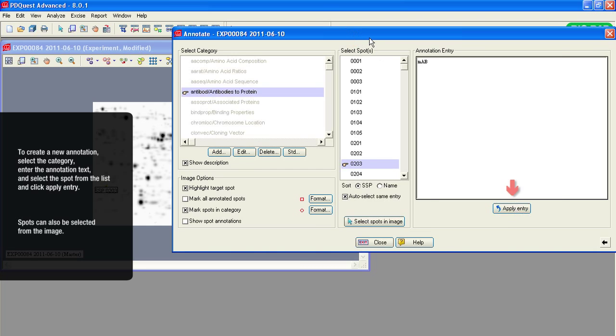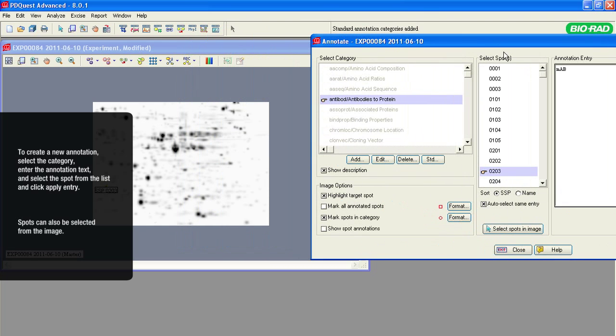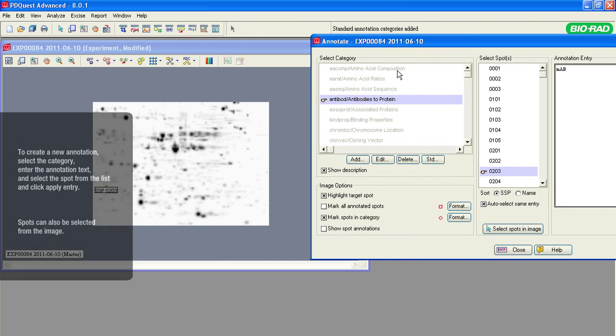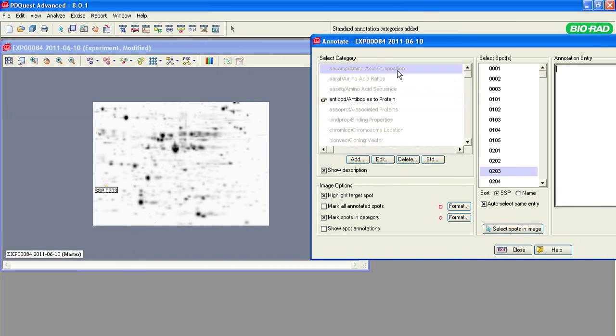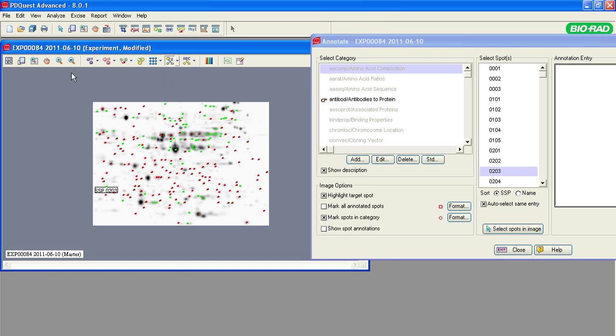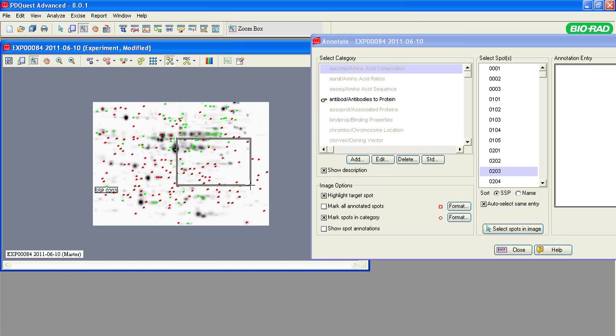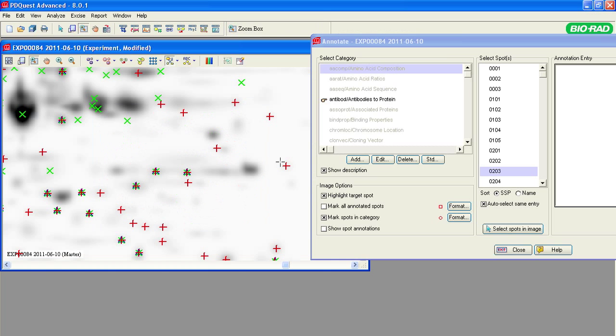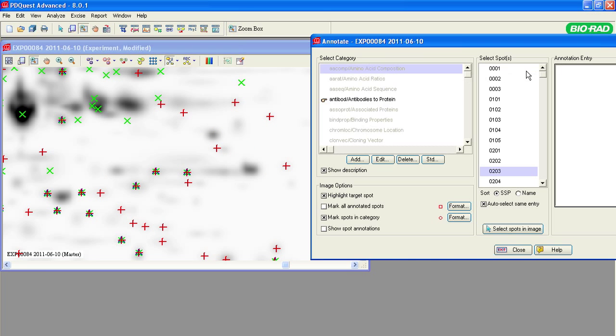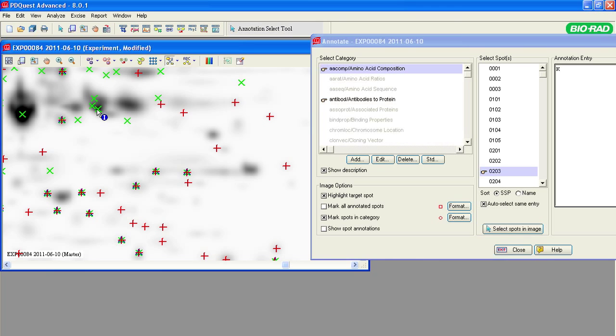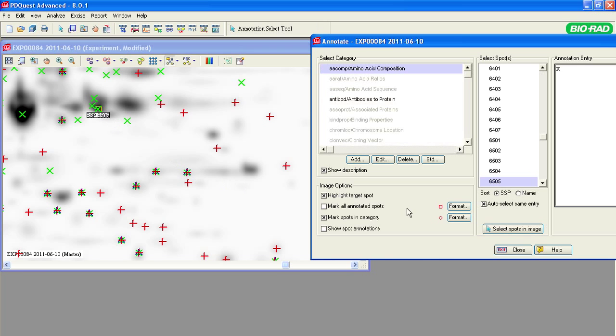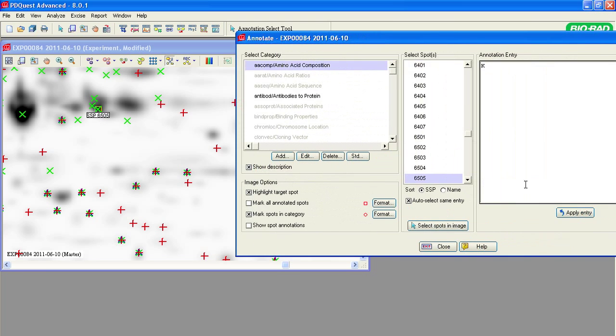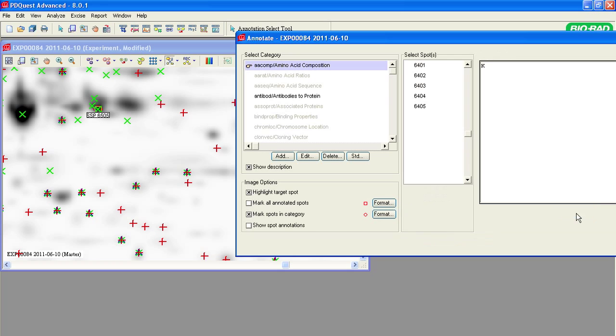You can also select spots from the image. For example, to select one of the preset categories, amino acid composition, first mark the annotated spots on the image, and in the annotation entry, type K for lysine. Next, click Select Spots on the image. Point to the spot that you want to annotate and click Apply Entry.